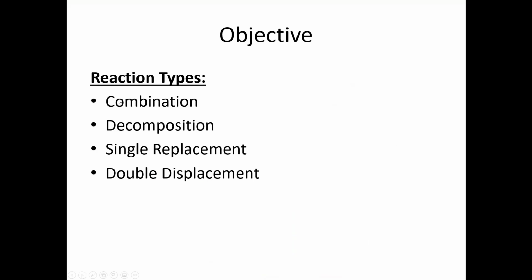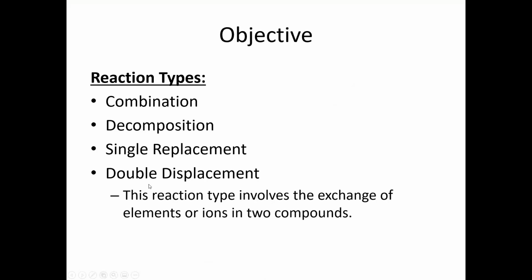Remember, we have different reaction types: combination, decomposition, single replacement, and double displacement. The focus of this experiment 1 will be the double displacement. That reaction type involves the exchange of elements or ions in two compounds.